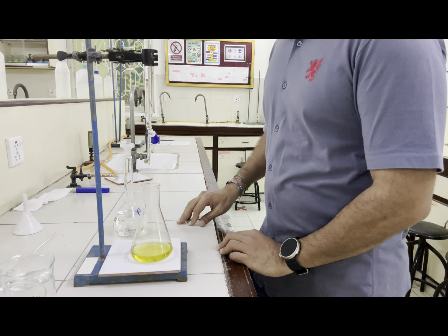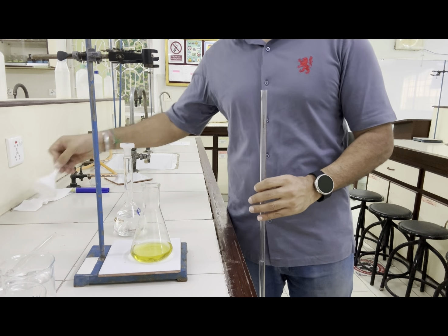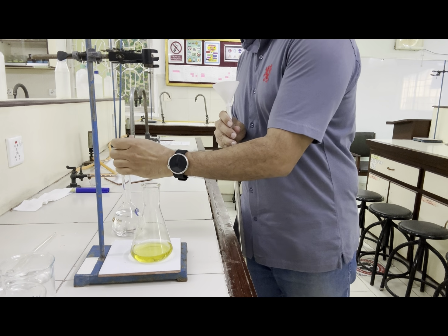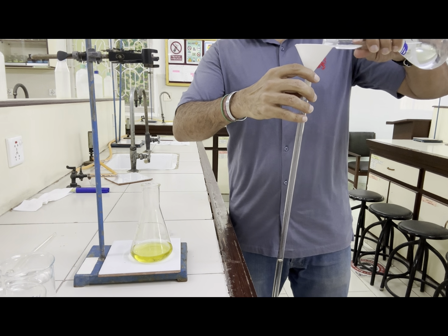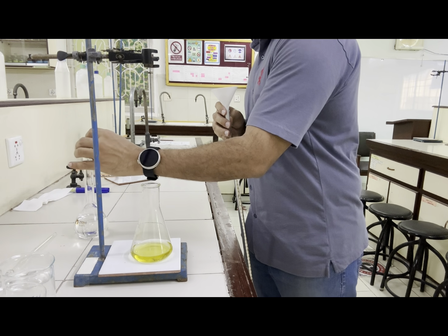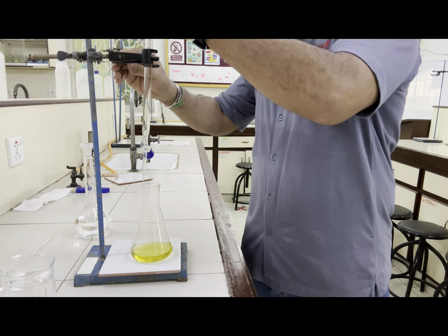Now before we start the accurate titration, let me refill the Burette, as it was used more than 30 cm cube. So let me refill this Burette with the Fa3 solution made, and remember to mix the solution before you use it. Now once we are doing accurate titrations, we do not necessarily need the initial reading at 0. It could be any reading lesser than 5, 4, 3, something like this. So I have taken here lesser than 1 this time. I will record the initial Burette reading.